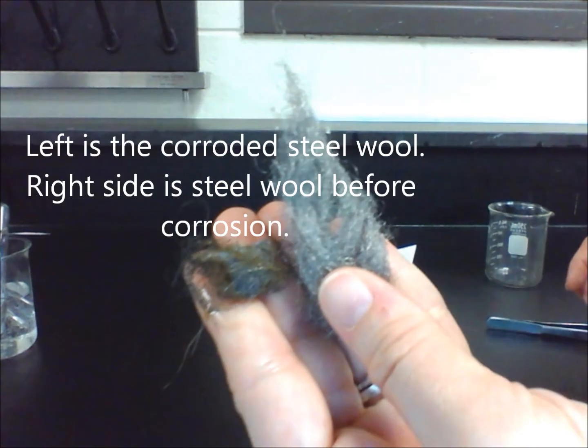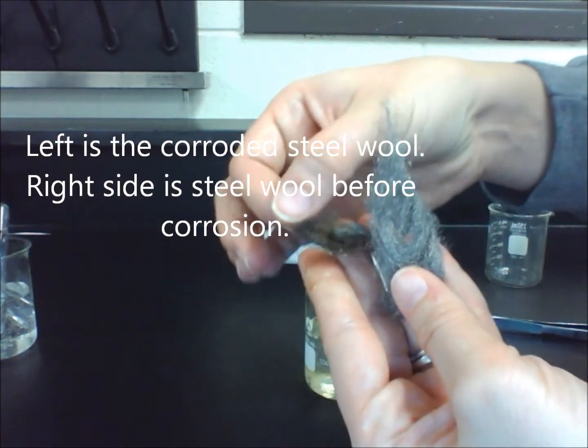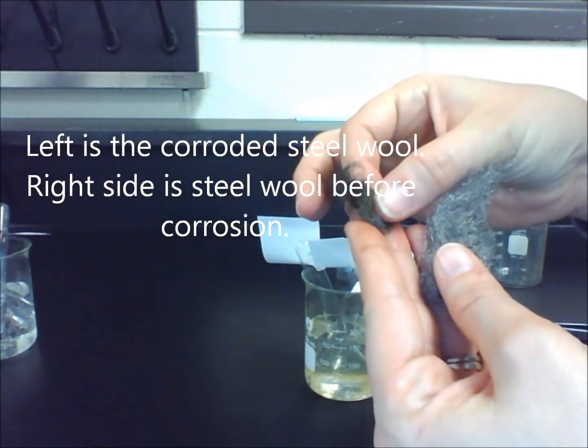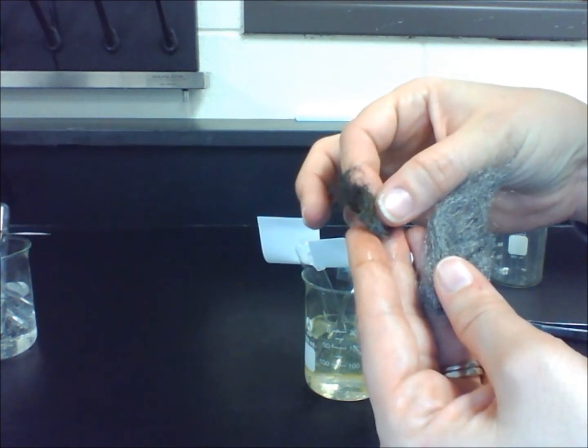The two elements that combined were oxygen and iron. Oxygen and iron were the reactants because they were what combined at the start of the chemical reaction.